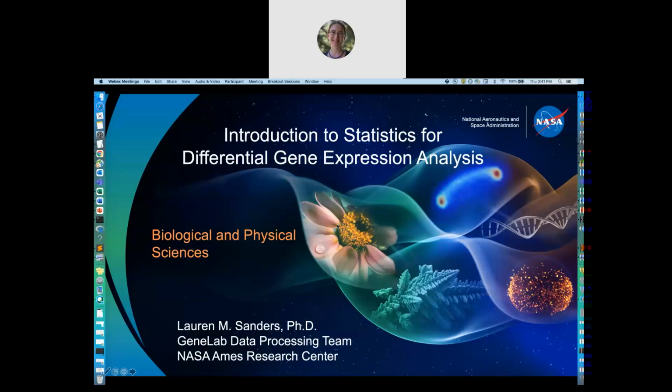I had a question about why we're filtering, because wouldn't we want the smaller counts essentially? Like, why would we want to filter out any of the genes with counts lower than 20 or lower than 50, or in this case, lower than 10? That's a really good question. And the reason is we don't want to filter out anything lower than 20 or lower than 50.